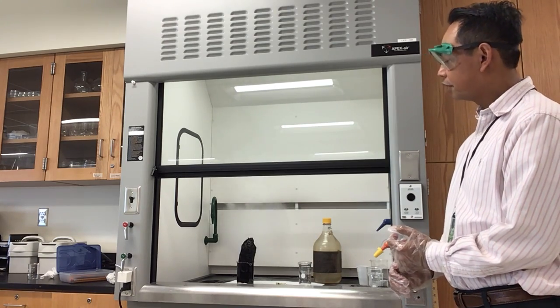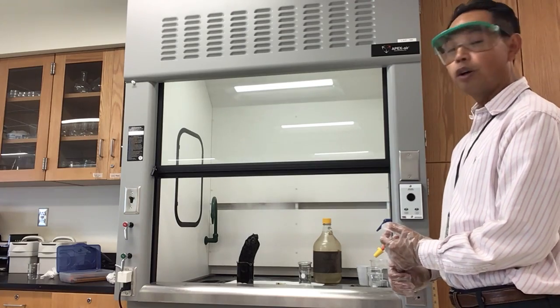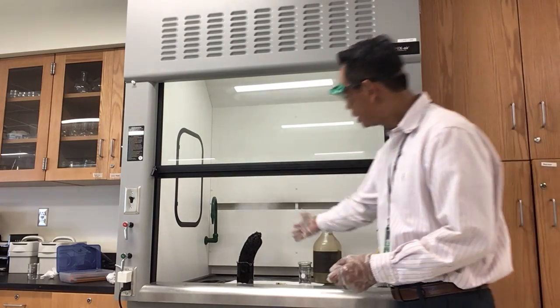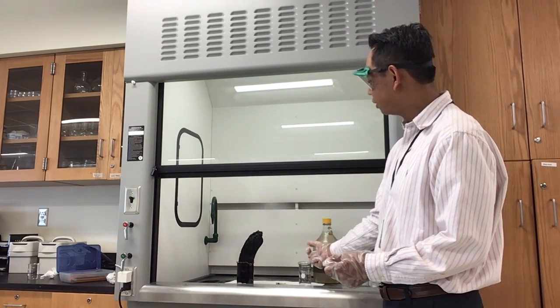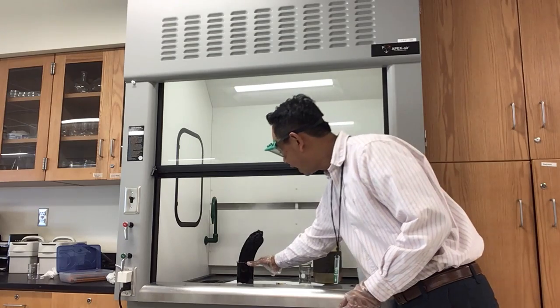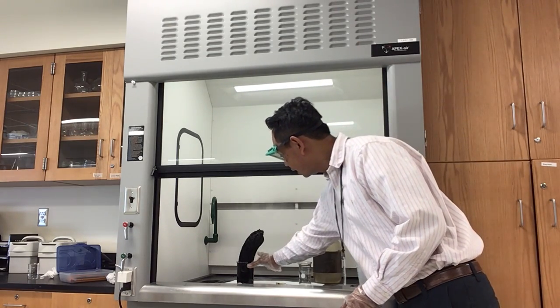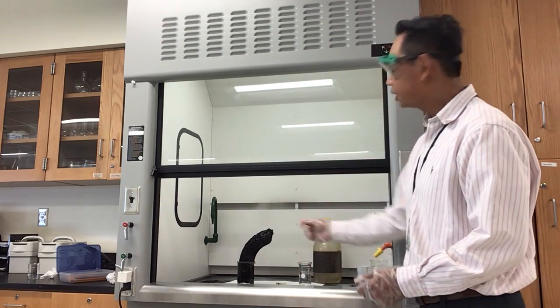Because sulfuric acid is a dehydrating agent, you remove the hydrogen and the oxygen, which leaves only carbon. So this is pure carbon. Every time you see the steam, you see a color change, it's a chemical reaction, right? And this is very hot. The smoke is part of the heat. I can feel the heat here. Okay? Just want to turn it a little bit so you see it better. The beaker is very, very hot.